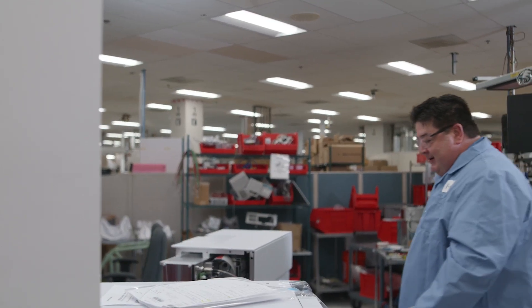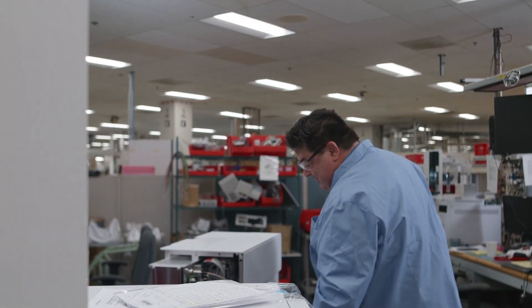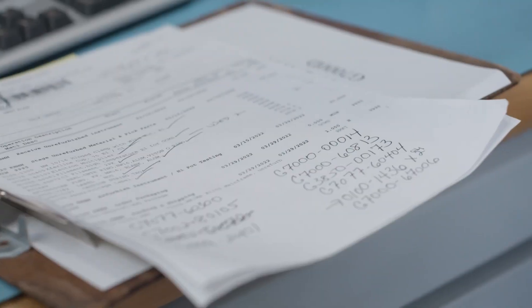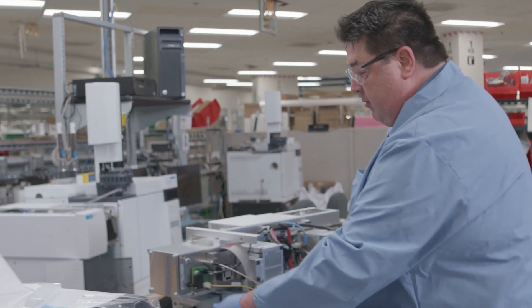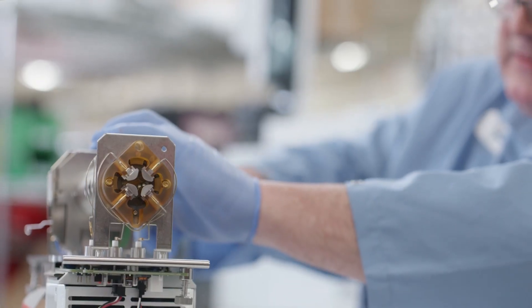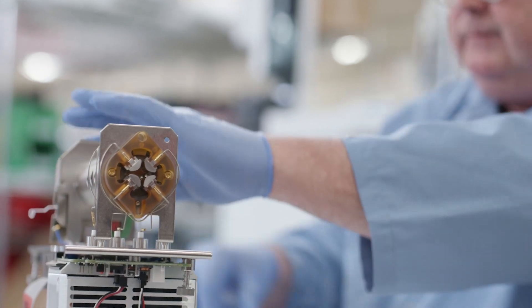When I first get an instrument, I'll look it over and inspect it. I check service notes. We clean and decontaminate the instrument. So right now I'm just removing all the wires. We'll inspect the quadrupoles for dust or damage. We update the parts — we use genuine Agilent parts.